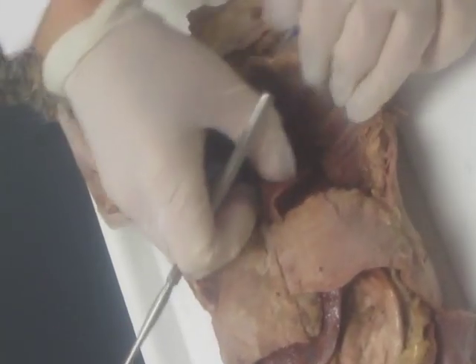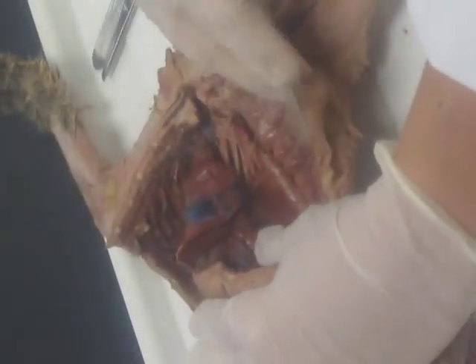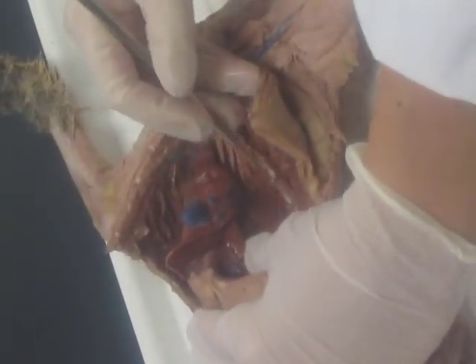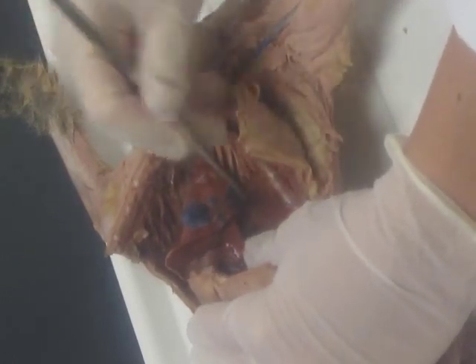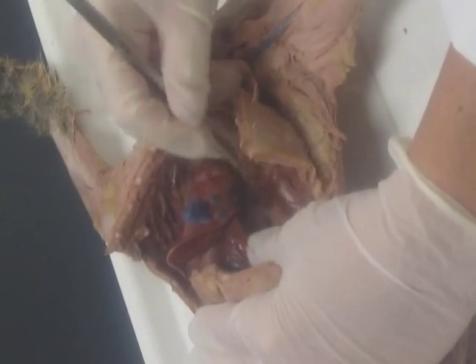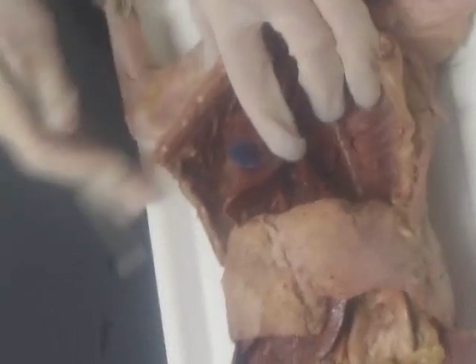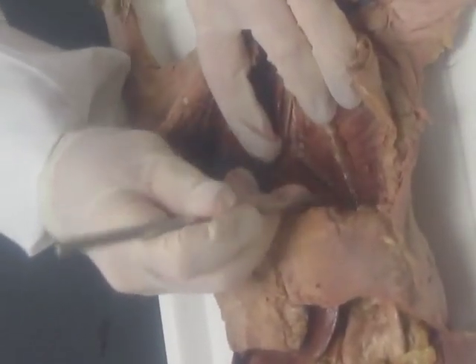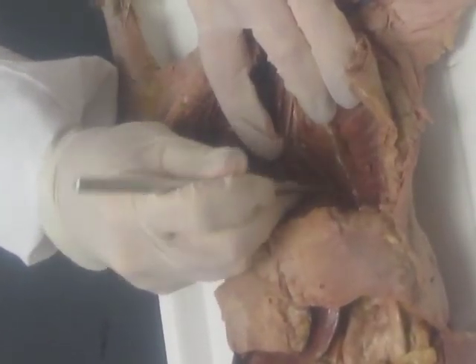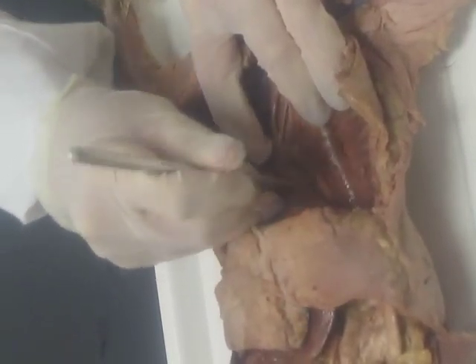Now you're going to find the descending aorta. Move the left lung away from the body cavity, and down in here you're going to poke through that mediastinal pleura with your probe — blunt dissection, kind of like we did around the kidney — and you're just going to unwrap that descending aorta like that.